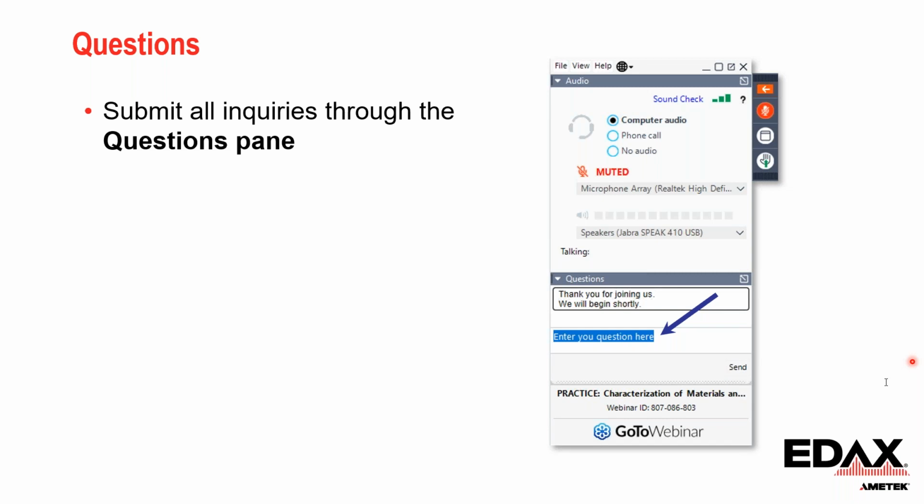Yes, you can do peak deconvolution to correct it, but this approach is secondary and results in a higher error. The deconvolution will be particularly difficult if you have a trace element peak overlapping with a major element peak. For WDS, the peak overlaps can be resolved intrinsically, which means there is no overlap in the WDS spectrum. This is the best practice to give you the most accurate results.